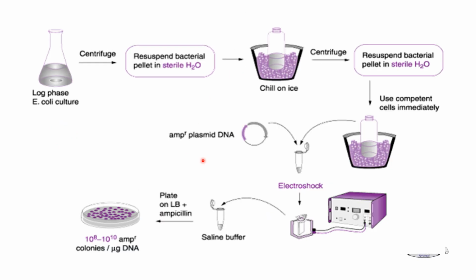After the construction of the recombinant DNA, next is amplification of the recombinant DNA. For that, different methods of transformation can be adopted. One such method is shown here. The bacteria is transformed by using the electric shock. Besides this, there are several other methods that can be used.